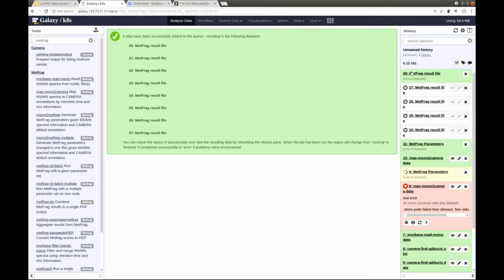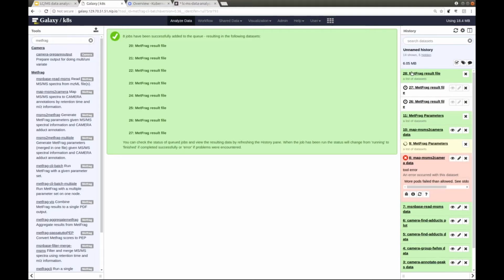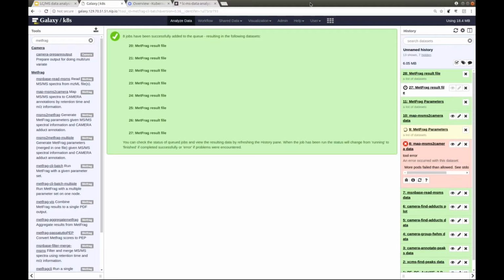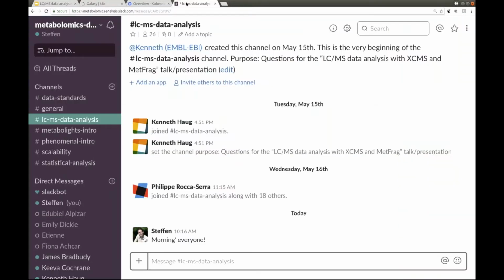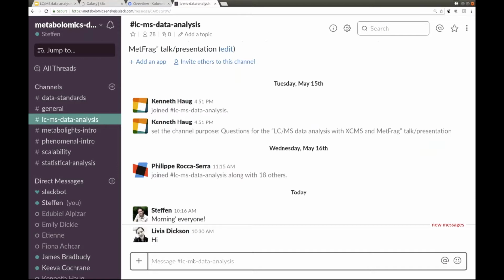James, what do we do? Do we have a query and answer now, or do we have the quiz now? Hi, Stefan. We can do some question and answer. We've had a couple of questions. The quiz we'll hand out afterwards. So okay, it's up to you. If you want to finish your demo, we can do that. I'm basically done.